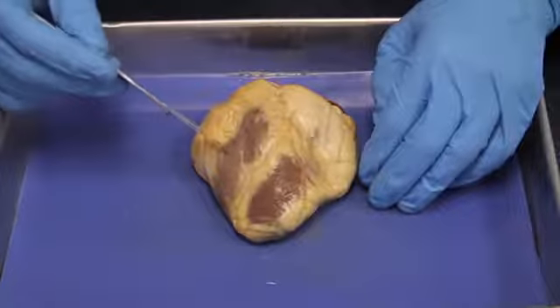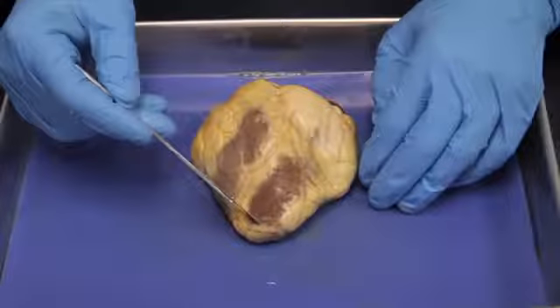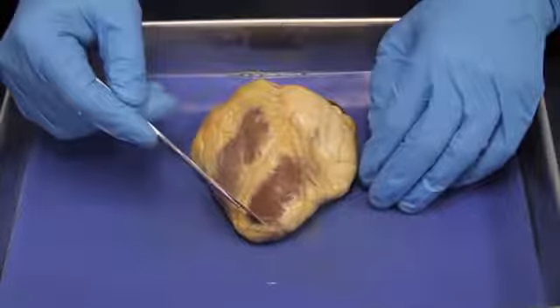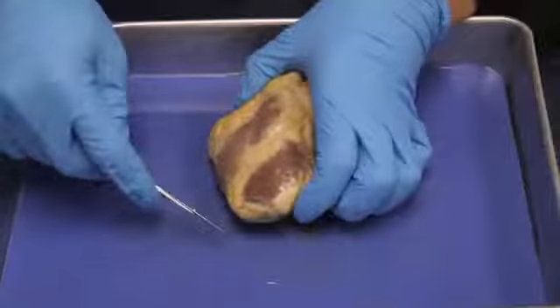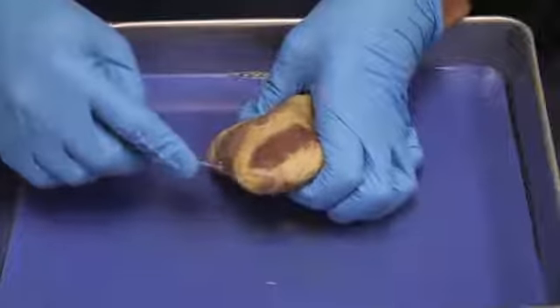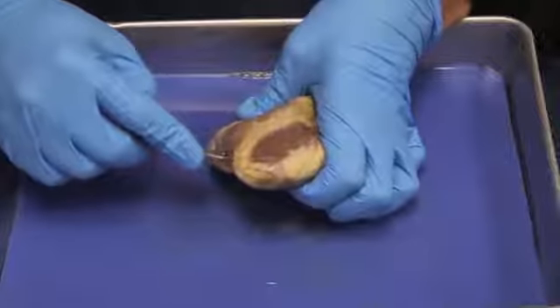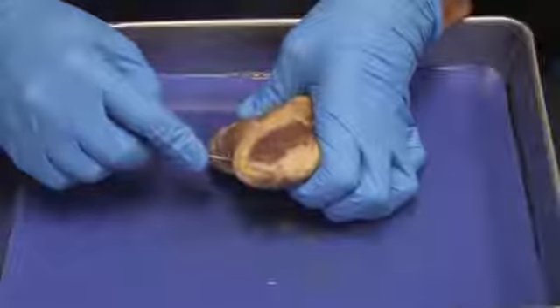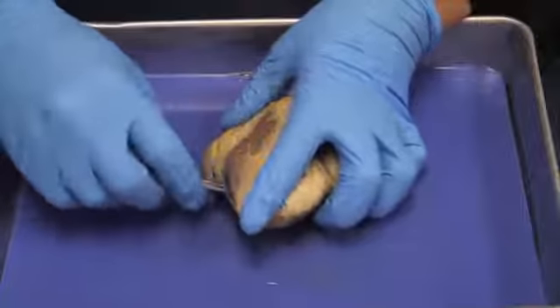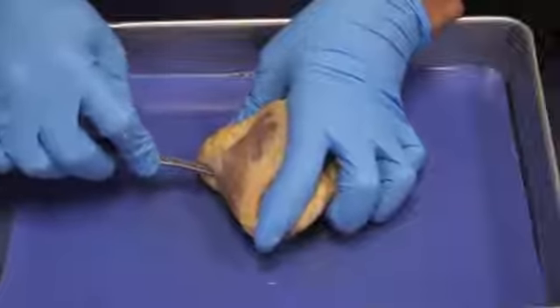Looking at the anterior side of the heart, we'll begin cutting at the apex. We are splitting the heart into front and back halves with a coronal cut. Using a saw-like motion, cut through the heart. As you cut, only put the scalpel blade into the heart, not the handle. Move up from the apex, cutting on the right lateral side, all the way to the base.